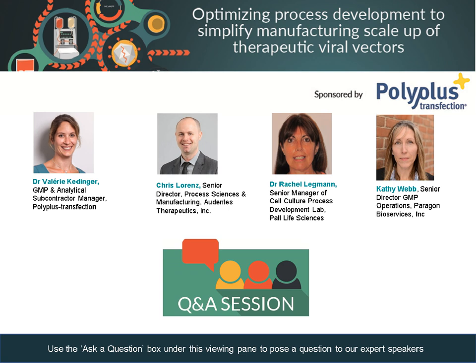metabolic state. So either you introduce perfusion into your system upstream, as Chris mentioned. So it's all about growing the cells, gearing toward the transfection. How well they reach this point, how well they will be accepting the transfection complex in a more efficient way. So this is a very good question. We are doing a lot of effort, but I think more needs to be done in order to understand how to improve this efficiency before the market is moving into stable cell line. Very good point.